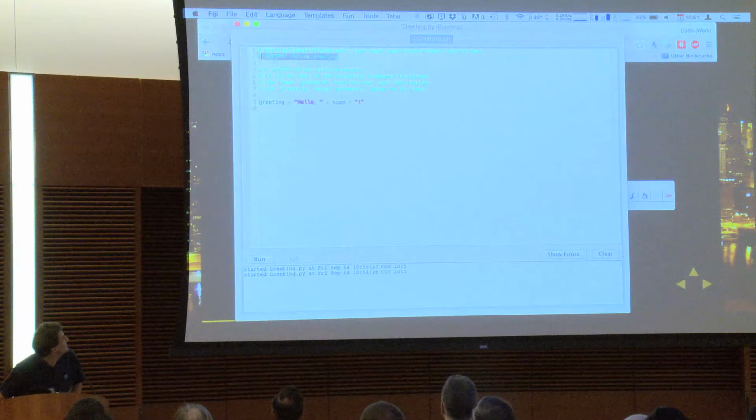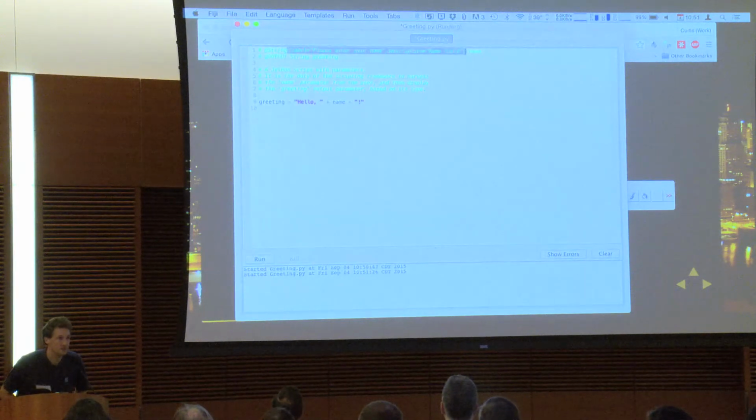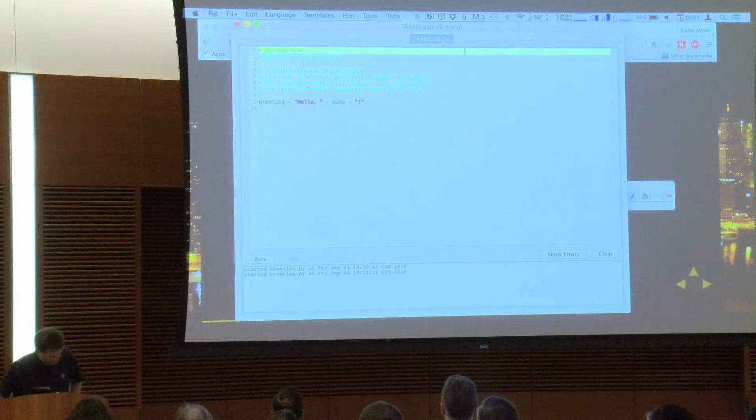And as you can see, it works by having inputs to string and an output greeting. You can already see here how you start to give some hints about parameters if you care. So like, I don't need this, right? I can get rid of this label here. But if I do that, try it, right? Get rid of the parentheses and hit run again.